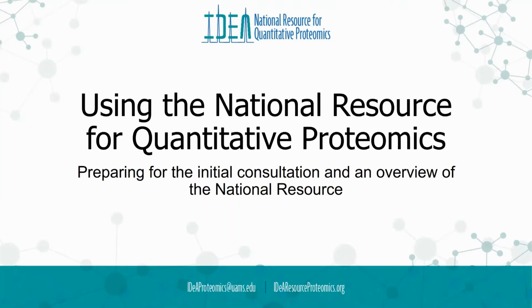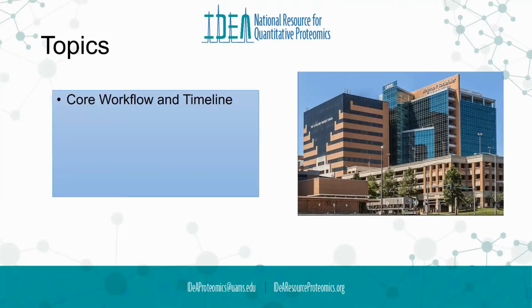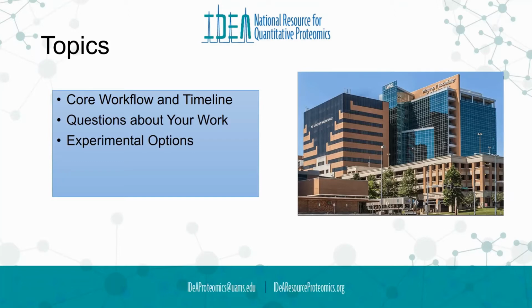The purpose of this video is to give you an overview of the national resource, as well as to prepare you for an initial consultation if you decide you want to use the core. Some of the topics in this video are going to be the core workflow and timeline, some questions about your work, some experimental options that we offer at the core, sample preparation advice, and a word about final reporting.